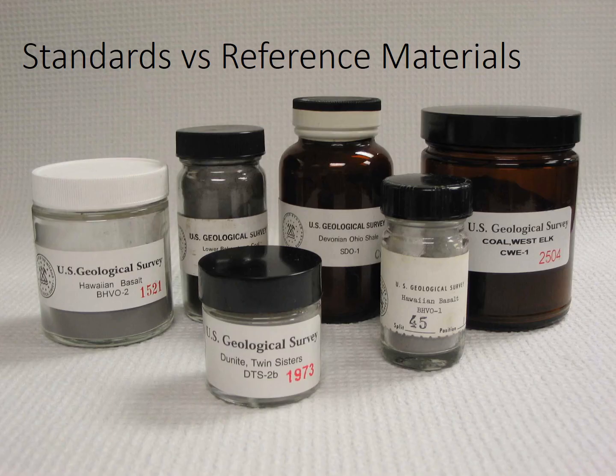And the way we go about that is we have reference materials. You've probably done this with other measurement techniques as well. We have standards, where say we go to the chemistry shop and we say, can I have a solution of cadmium that is 1 ppm? And they'll go, there you go. Somebody has got some cadmium and weighed it out on a balance and then weighed out some acid to dissolve it. You get a certificate with it that says this solution is this concentration. And we would use that to convert our counts per second or whatever it is into concentration. So that's what a standard is. The standard converts our machine output into a concentration.